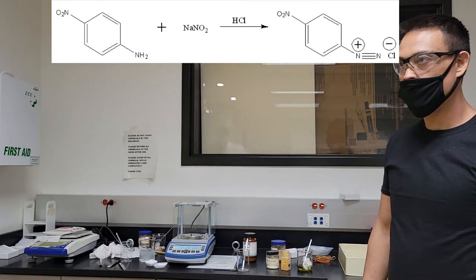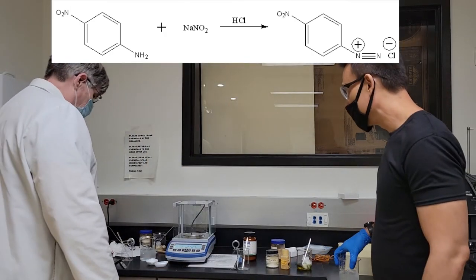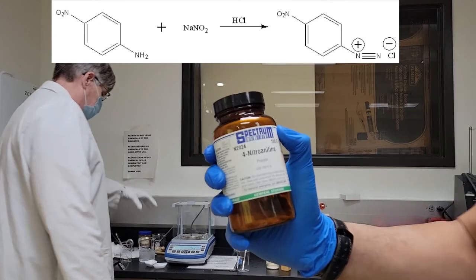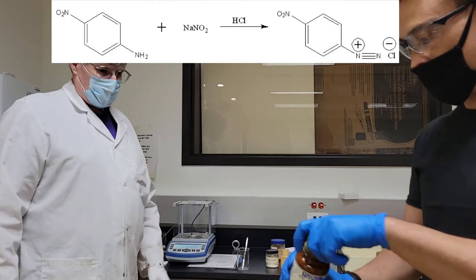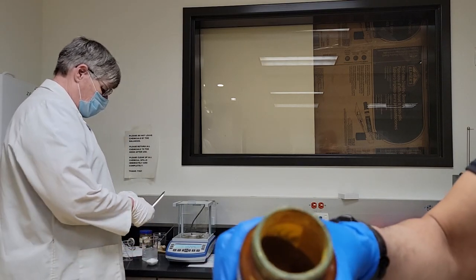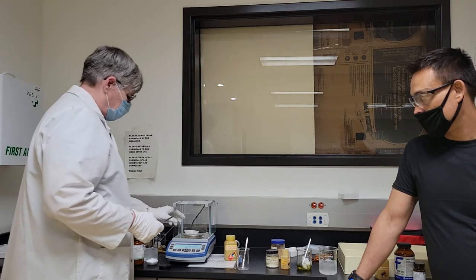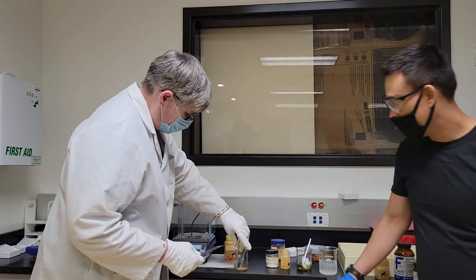So the next half of the reaction is to do an ice bath. We're each going to do about a gram of the 4-nitroaniline, also known as para-nitroaniline. Put it into another beaker. It looks like a yellow-brown powder. What's going to happen when we finish this all, it kind of looks like a pukey yellow. That was almost perfectly a gram, so we're going to put it into the ice bath.